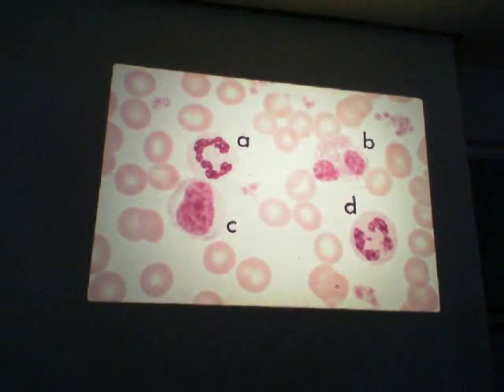What cell do we have right there? Neutrophil. And how about that cell right there? And that cell. Yeah, band neutrophil. And what are these things? Platelets. Now if you look at this slide, the red blood cells that we see here, oh, what is that cell? Red blood cells. See these red blood cells? Note the color.